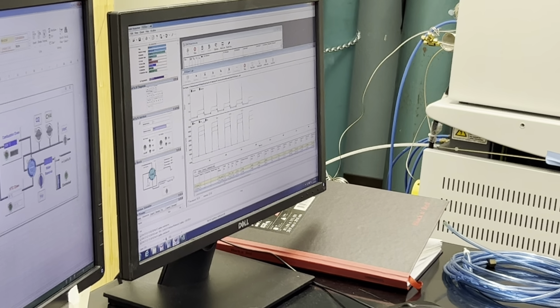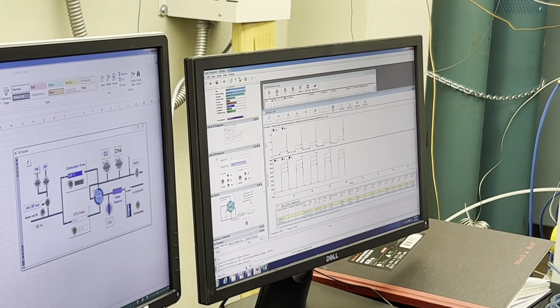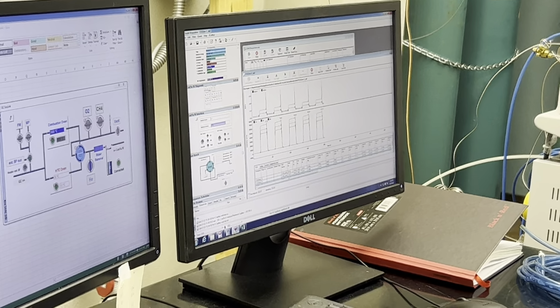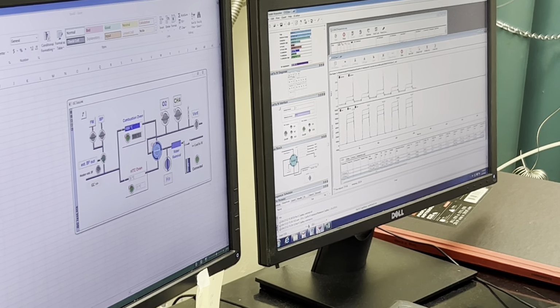As I said, some lab had a pretty similar problem. The long term, sometimes it's very erratic and gives you very bad results. You don't know. It's unpredictable. Completely.